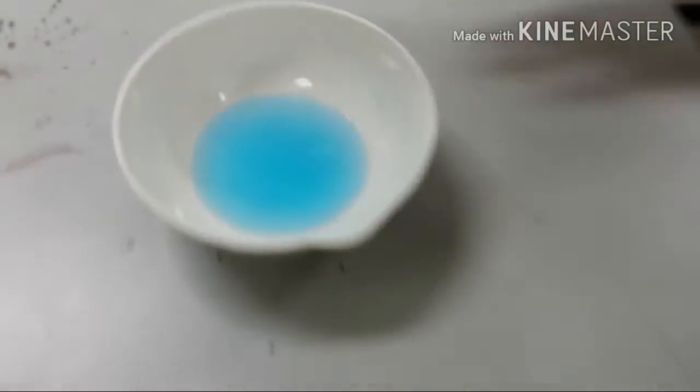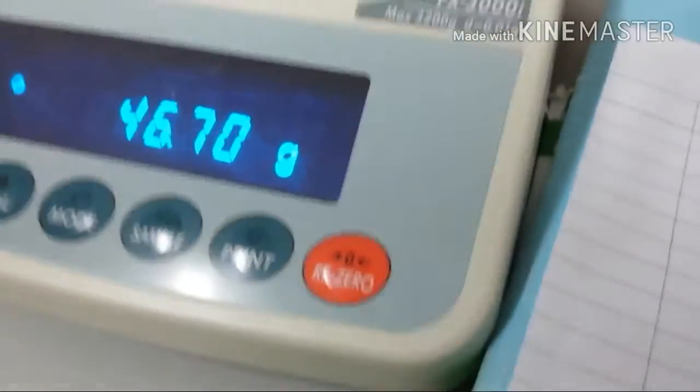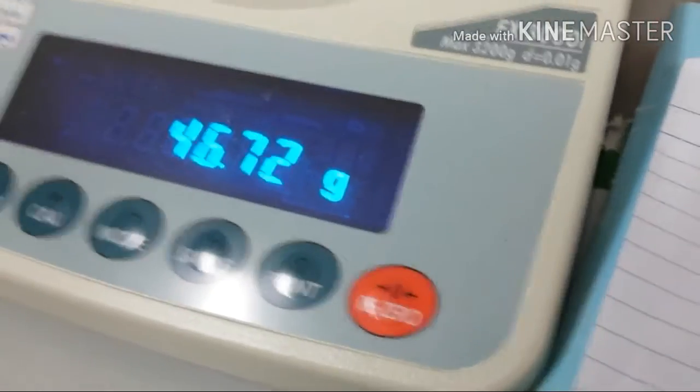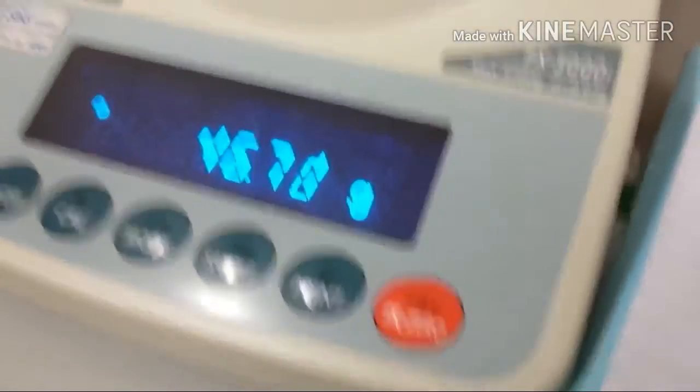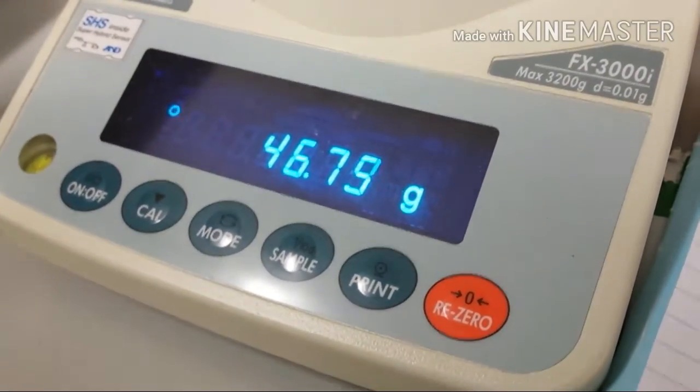Now we're gonna measure mass. So now we're gonna try measuring mass and stuff. It starts at zero kilograms. As we can tell, it weighs 46.70 grams. 46.70 grams.